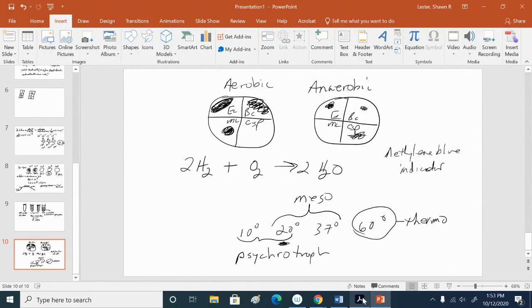Right, and most bacteria tend to be which one? Mucoid, right? Some bacteria are very, very mucoid, others not so much, but we still call them mucoid. And if they look rough, crumbly, we say they're dry or friable. And for pigment, do all bacteria produce a definite pigment?